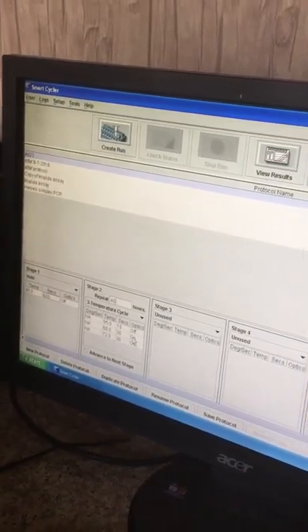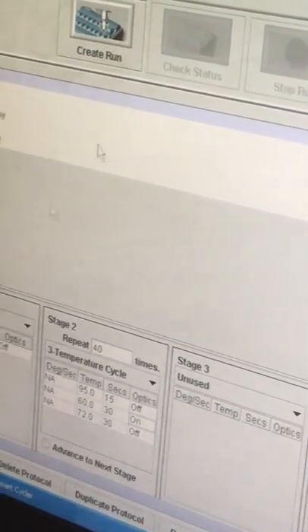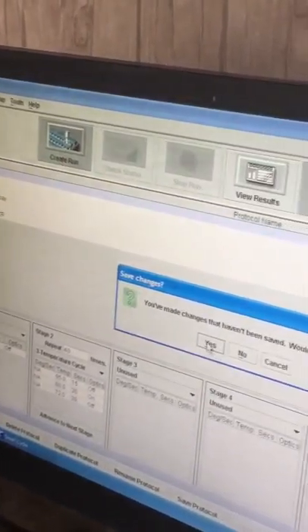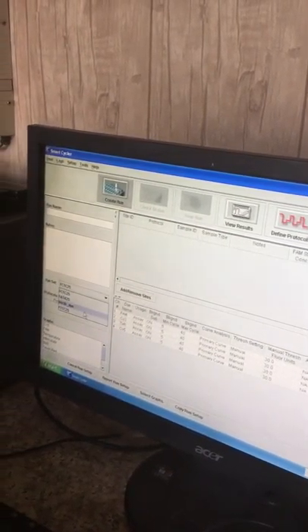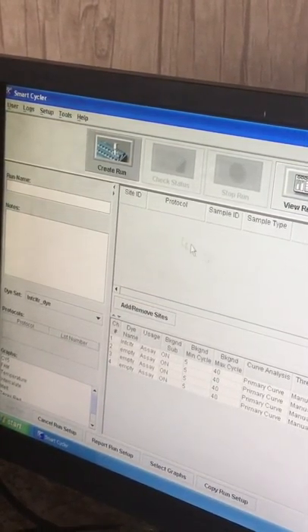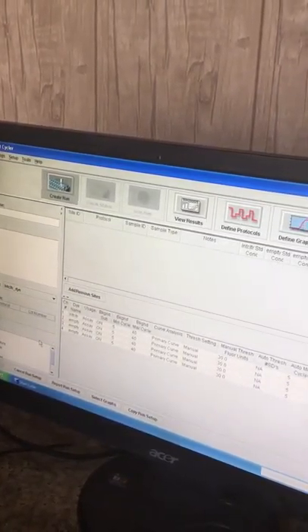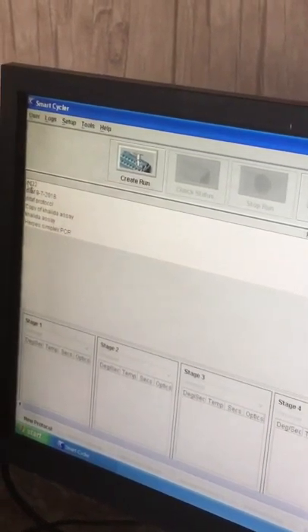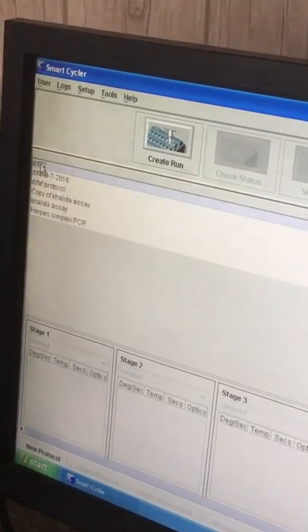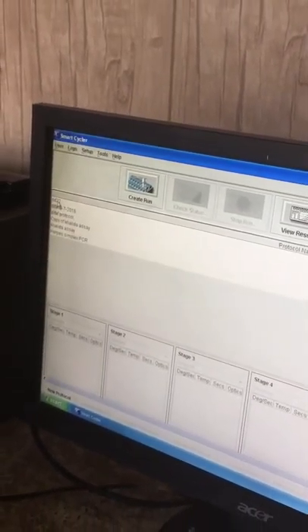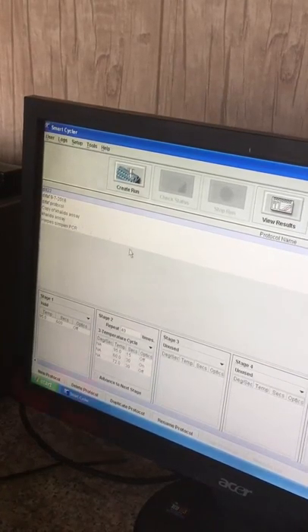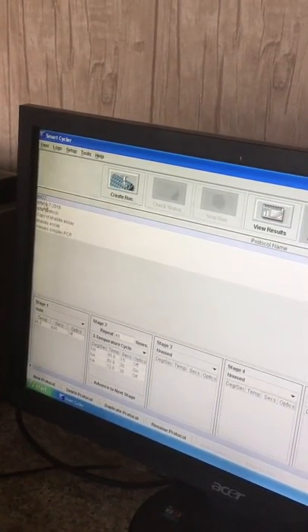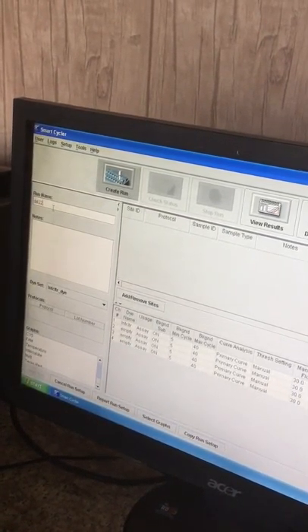After that, going to create run. Now we'll select intercalating dye and should appear the protocol that's named DD22. We'll select this protocol.